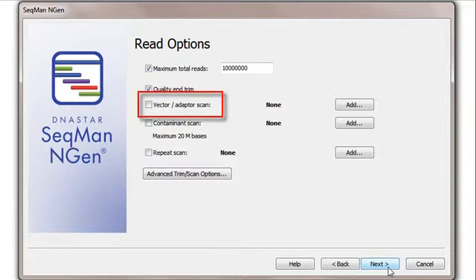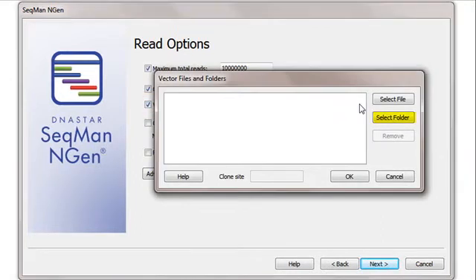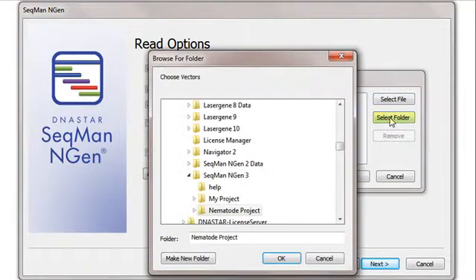To do this, I just click the box next to Vector Adapter Scan, then click the Add button to the right of that. Then I'll click the Select Folder button and navigate to my SMART Linkers folder.